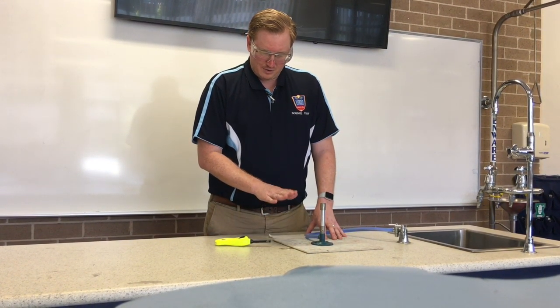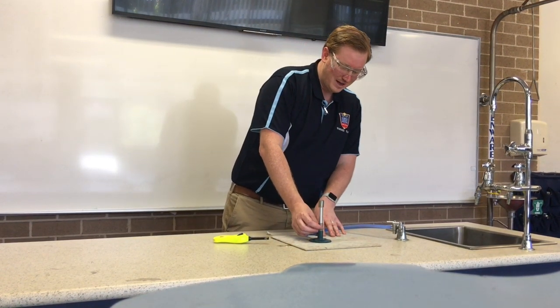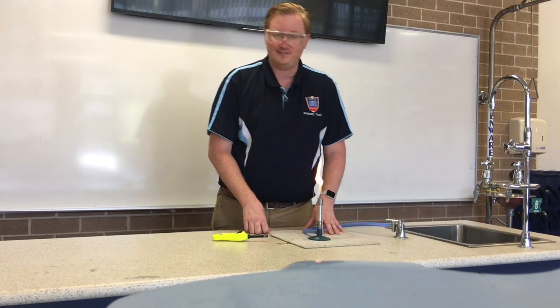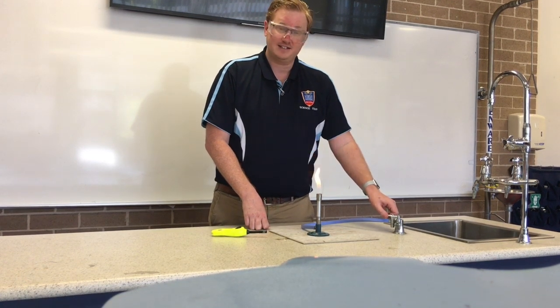So when you're finished heating with the blue flame, turn the collar back to the safety flame. Now everyone can see that flame and it's a lot safer. When you finish with the experiment, turn off the gas tap.